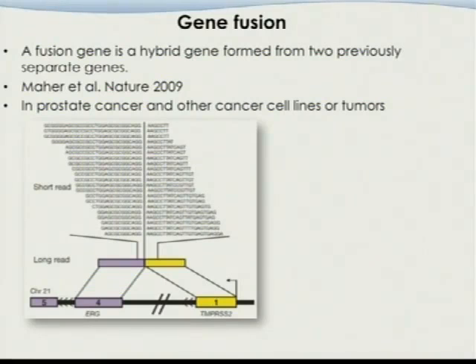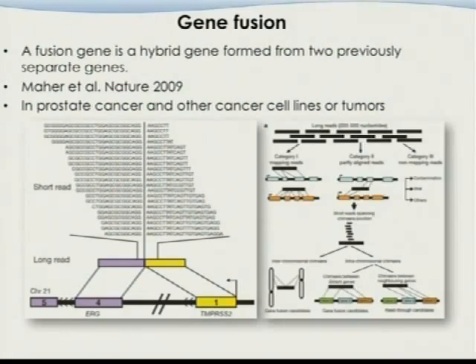But you can see that at this joint location, there is very clear evidence that the gene fusion occurred. Of course, it's easier to say and easier to look at from this point of view. But before you do the alignment and everything like that, it's pretty difficult to find this type of pattern. Okay, and this is the experimental procedure they did.